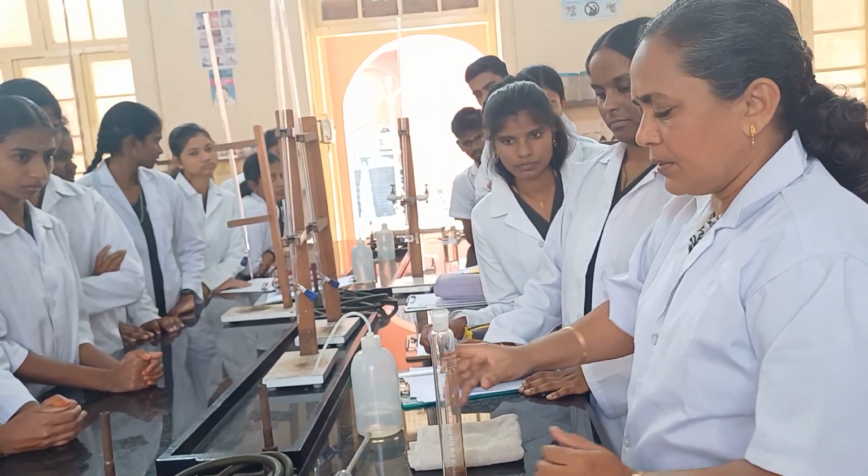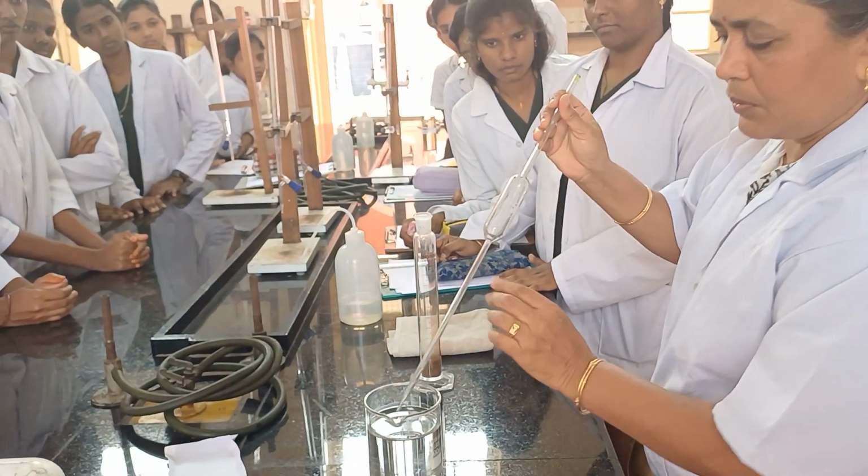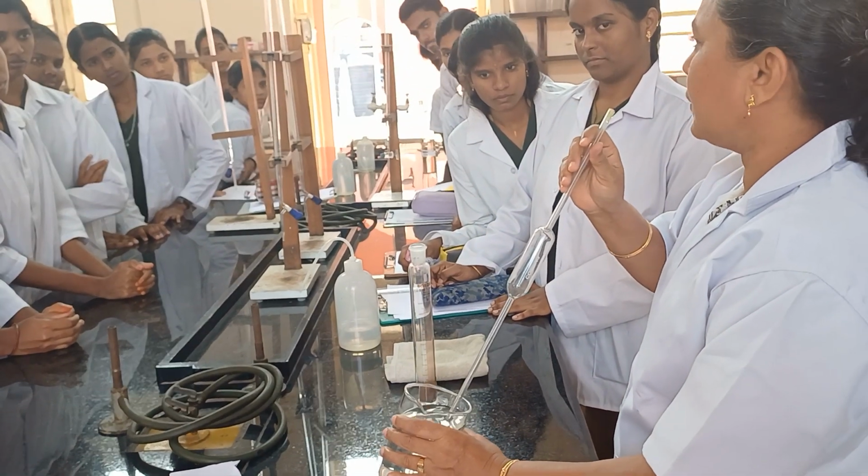Then afterwards, pipette out and add 50 ml of water. We should pipette out; we should not use a measuring cylinder.